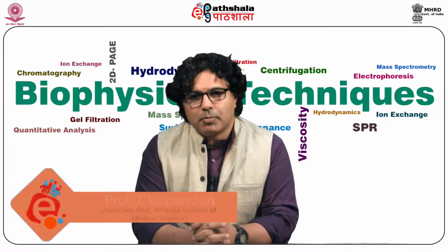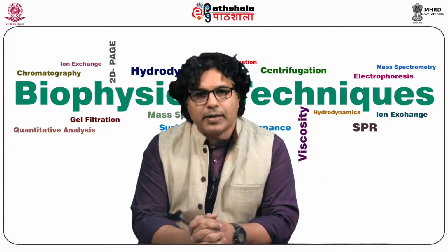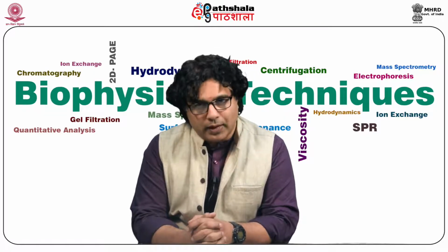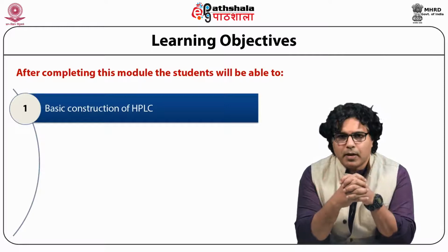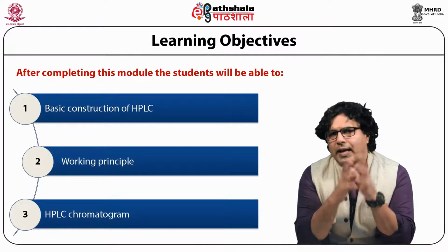Today I am going to talk to you about the module on working principles of HPLC and its applications, part 1. This is from the paper Techniques in Molecular Biophysics 1. In today's lecture I am going to talk to you about the basic construction of HPLC, the working principle of HPLC, and how we characterize an HPLC chromatogram.